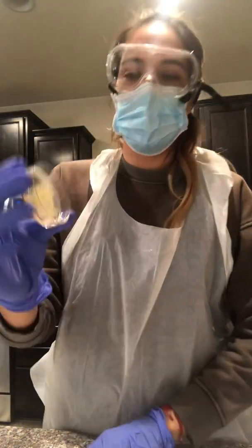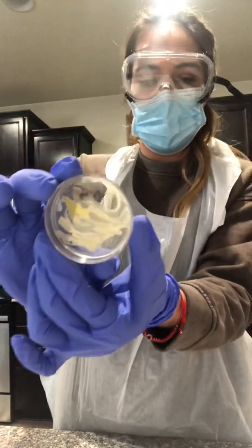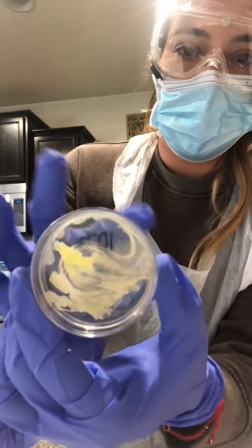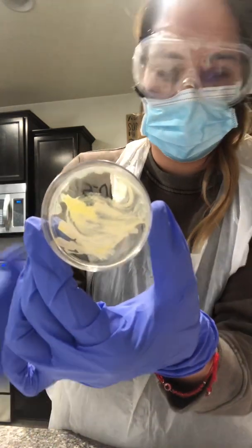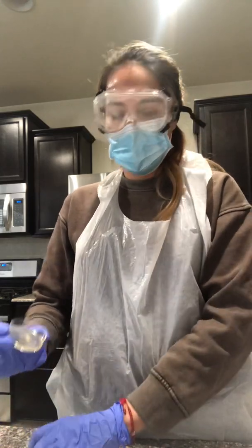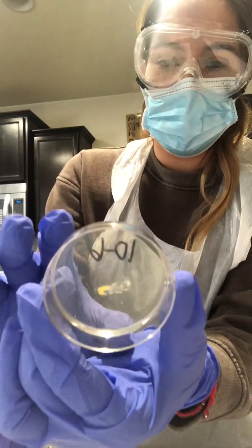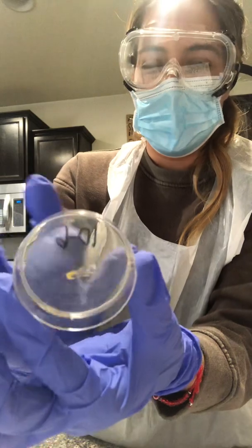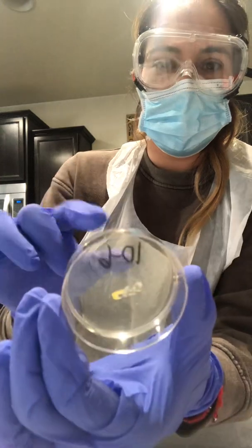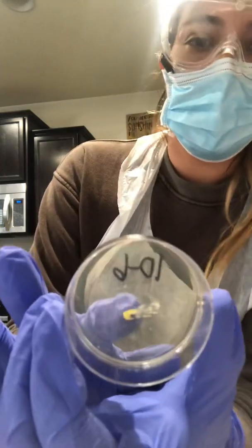And for the 5th one, to me, this one looks like it was the most successful growth. It has so many colonies, and it's yellow and a little bit of white on the outer, and it's mostly in the center. And for the 6th one, you see very, very small growth on the outer side of the plate, and I see it mostly in the center right here of the plate, and it's a golden yellow color.